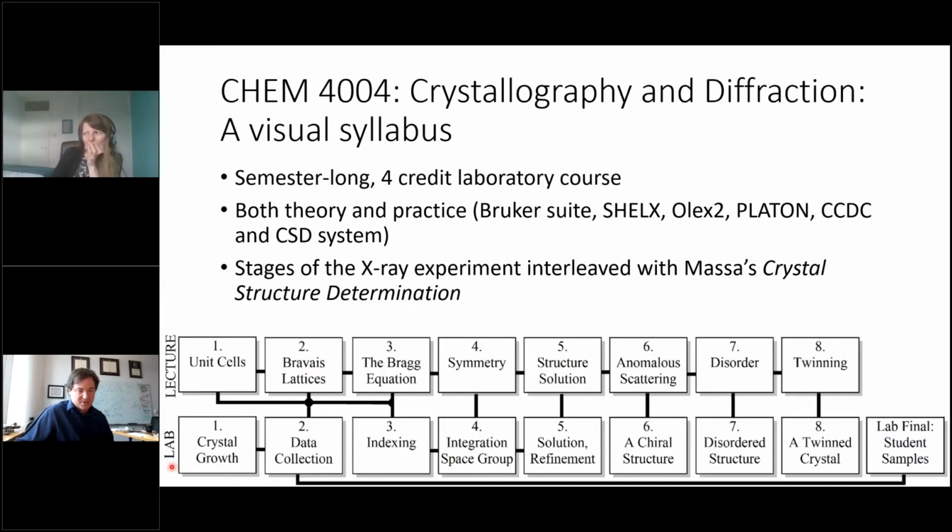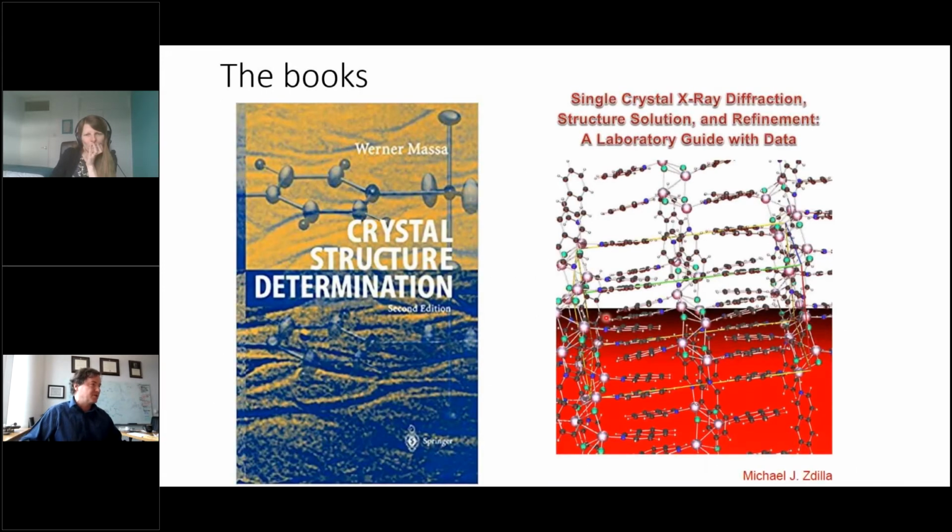But then interspersed with that, we have a lab where we use the Bruker suite along with SHELX, OLEX2, Platon, and CCDC software, where we go along, and rather than just sitting you down and mounting a crystal and showing you how to solve and refine it, we do this step by step. We just do an indexing lab, and then we do a space group determination lab, and we do this alongside the lectures so that students can understand what's behind each step of the crystallographic experiment.